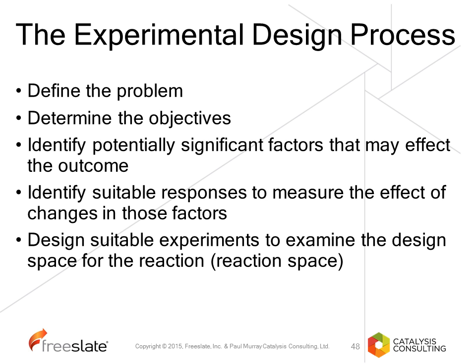You then need to think about the response that you're going to measure. If you carry out an experiment and you analyze it for conversion, but you've not analyzed it for impurities that are present in that reaction, you may not be able to go back and get measures of those impurities at a later date if you've not retained the samples or collected the right information. So you may not have selectivity or information about impurities that later prove to be important. So it's important that you think very carefully of the responses you're going to use.